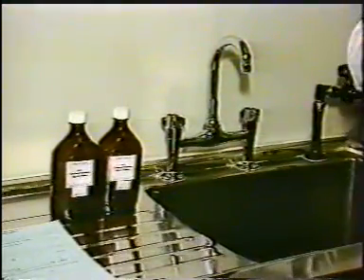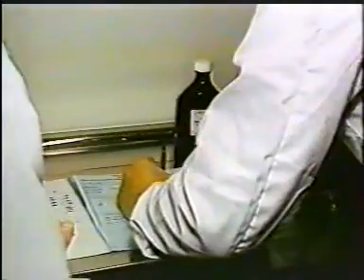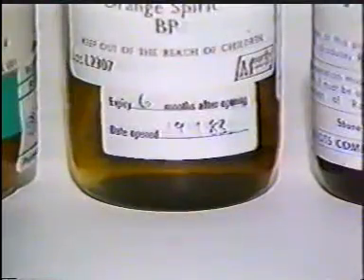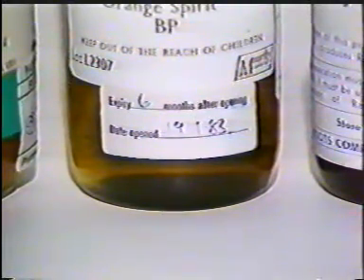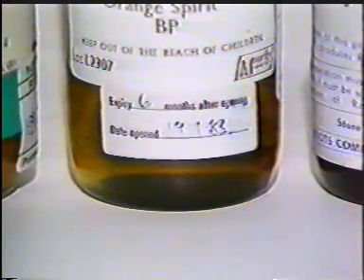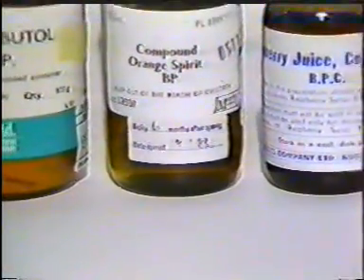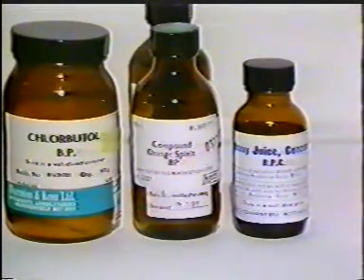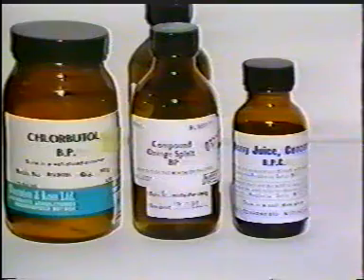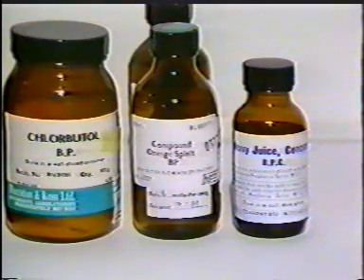Certain raw materials are relatively stable in well-filled, sealed containers, but may deteriorate once the container has been opened. Volatile oils are a good example of this. For such materials, the expiry date may take the form of a specified length of time after opening. In such cases, the container will have an additional label, and it is essential that the date of opening is entered on this, so that any remaining material can be discarded after the specified time.